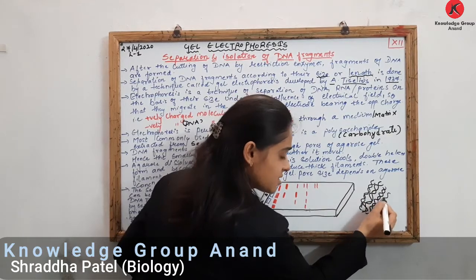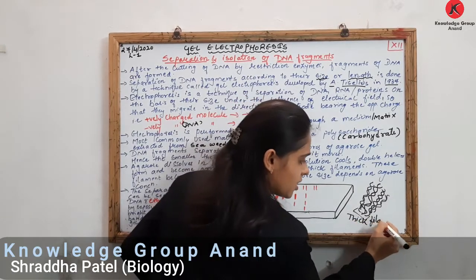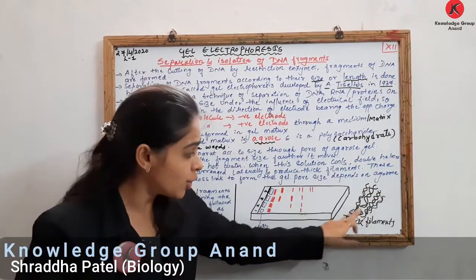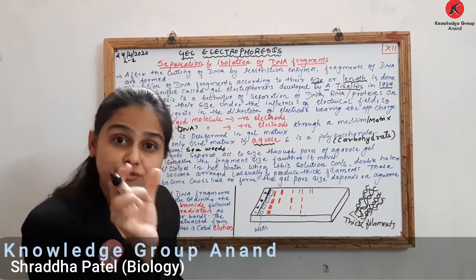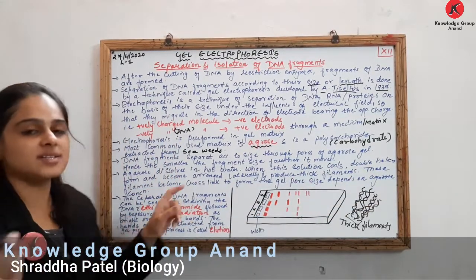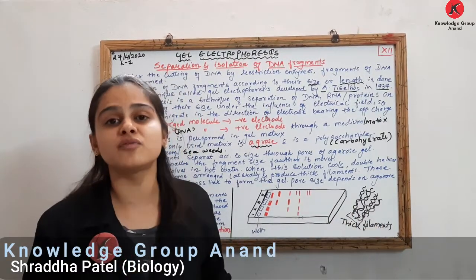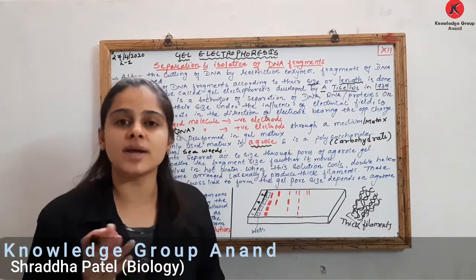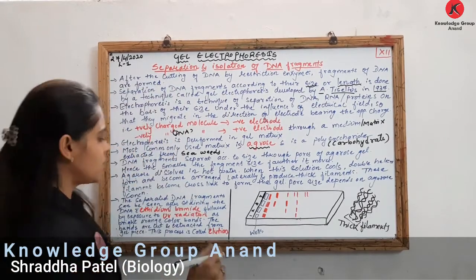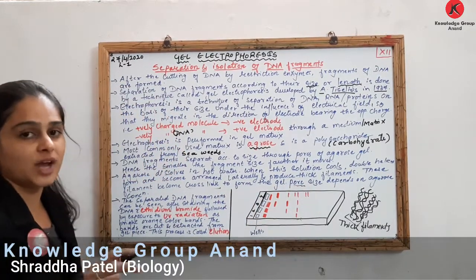Can you see this? Yes. This results in formation of thick filament. Once cooled, double helices are formed, and these double helices arrange laterally to form thick filaments. I have drawn one such thick filament here; many such thick filaments will form. All these thick filaments are cross-linked, due to which there will be formation of pores. Due to this cross-linking there is formation of pores.